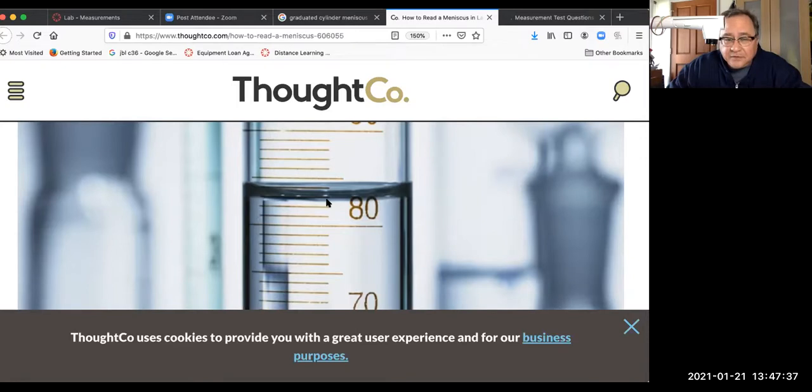Now, what should you consider to be a success on your part? Well, certainly if you wrote 82.7 milliliters, if you wrote 82.8 milliliters, I think that's a success. If you wrote 82.6 milliliters, I think that's a success. But I think the meniscus is more than halfway past 82. So 82.5, I think, would be close, but you want to do better. And because it's clearly underneath 83, if you had written something like 83.0, I think you need to improve that.